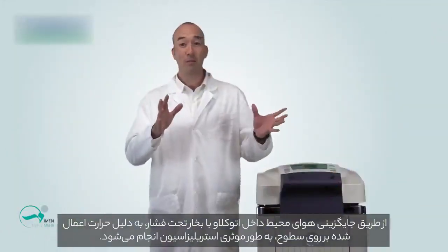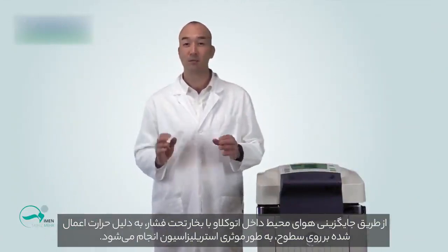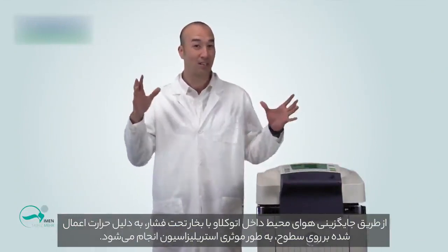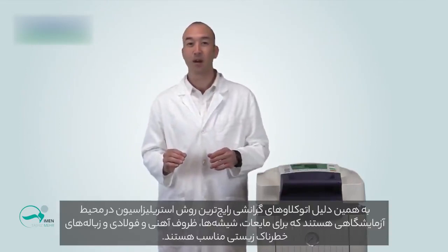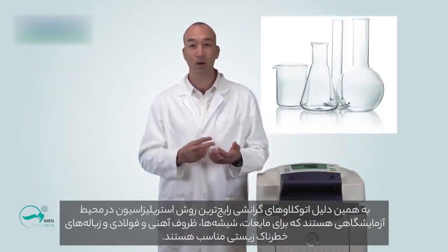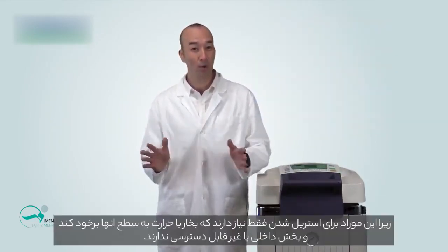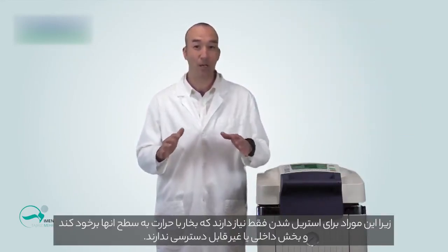Through the replacement of ambient air with pressurized steam, items inside the chamber can be sterilized effectively due to heat being applied to the surface through pressurized steam that saturates the autoclave chamber. Because of this, gravity autoclaves are suitable for sterilizing the most common laboratory media, including steel utensils, glassware, liquids, and biohazardous waste. This is because these items only need the steam to come into contact with the surface and do not contain any unreachable pockets and spaces within.